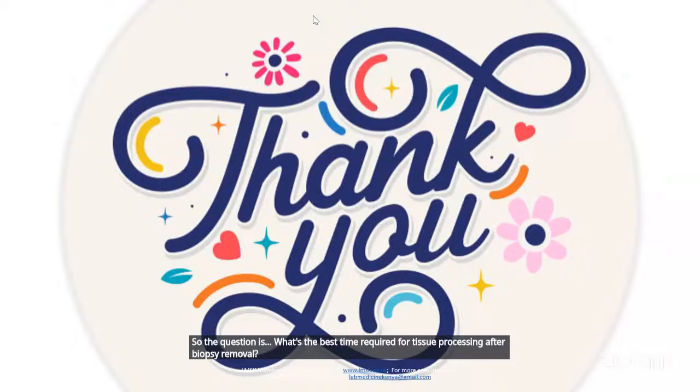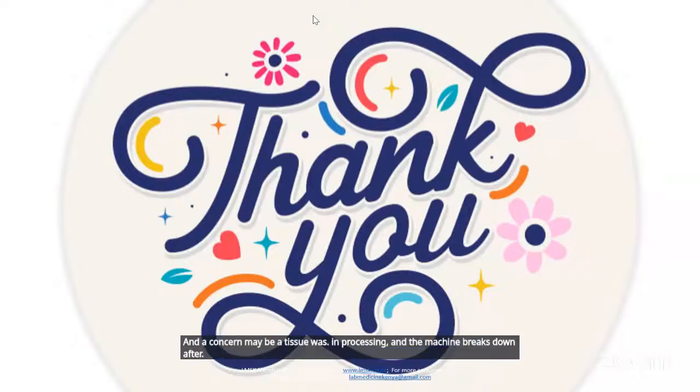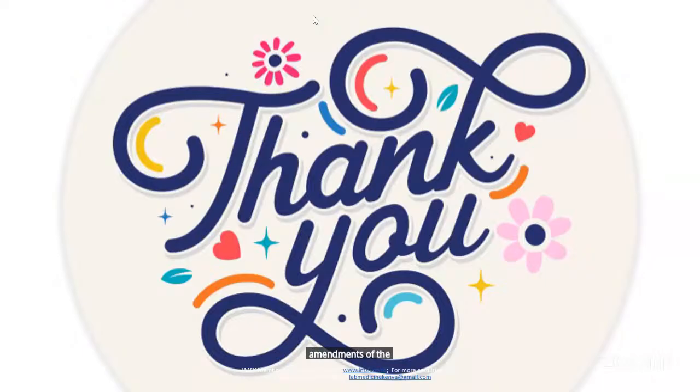And a concern: maybe a tissue was in processing and the machine breaks down. After amendment of the machine, is the tissue viable for processing continuation depending on TAT? I don't know if you've heard the question or I can repeat. I think I heard it.